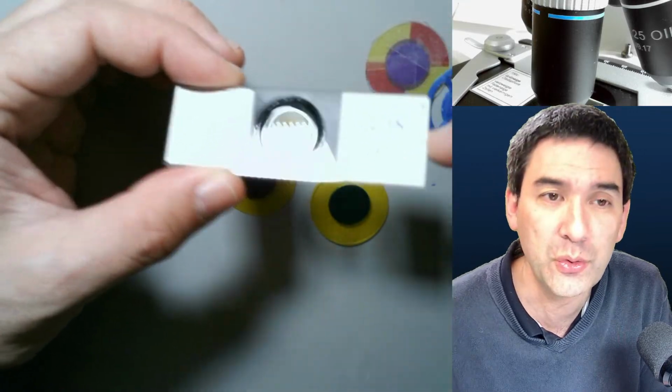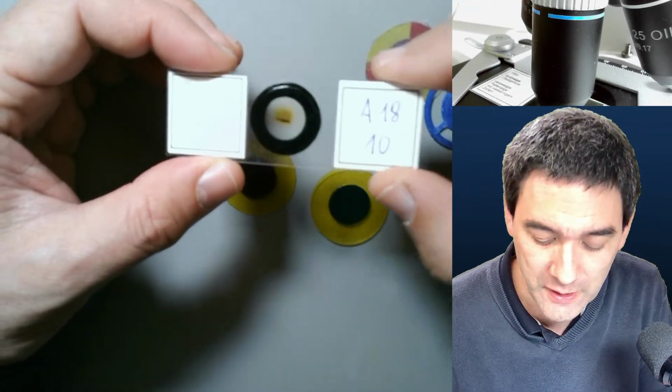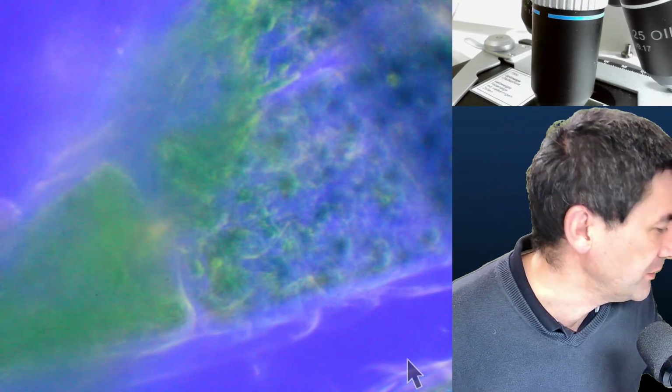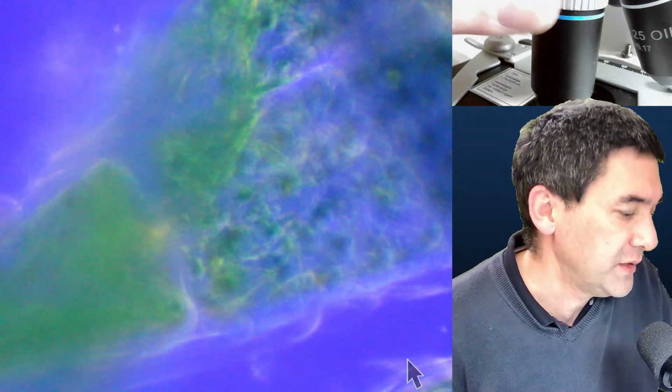And also to add physical stability. But the one that I'm showing you over here actually does not have a ring. So I'm not even sure whether this is actually mounted in glycerol gelatin.